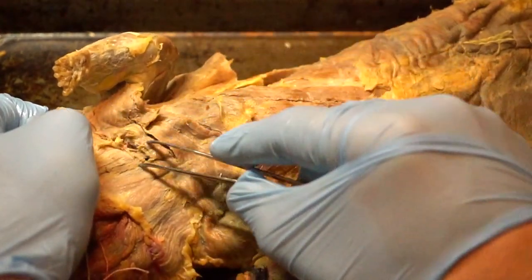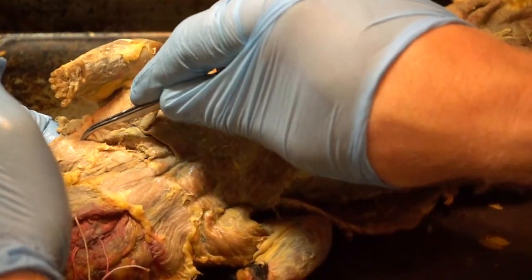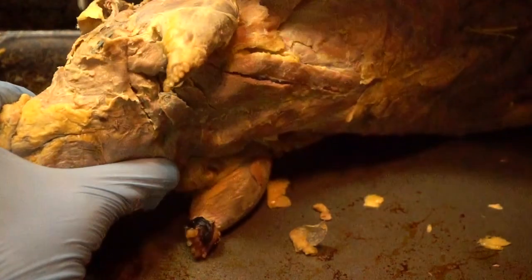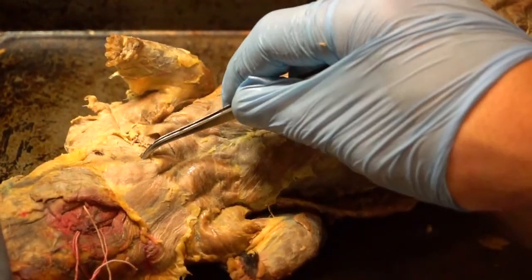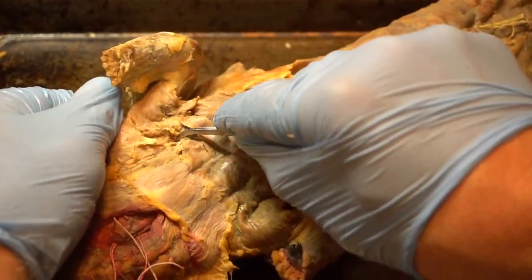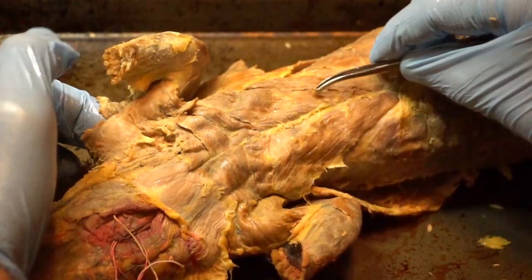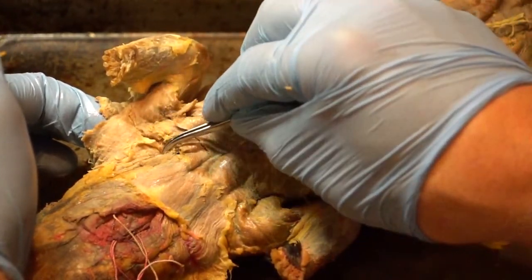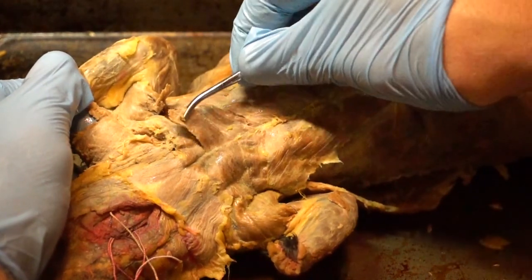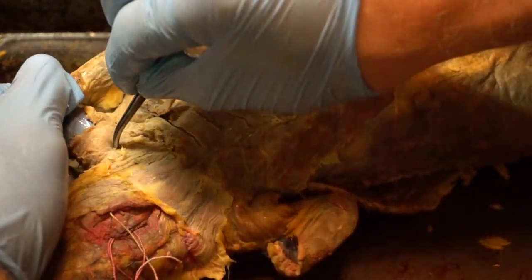When we cut out the rest of the pectoralis major at the upper anterior border, we cut it away from a muscle we covered last class — the clavotrapezius and clavideltoid. If you get the border out you'll also see another muscle underneath, which is still your pectoralis minor extending all the way up on the mink and cat. The pectoralis major is actually on top of the pectoralis minor. So one more time: xiphyhumeralis, pectoralis minor, pectoralis major, pecto antebrachialis, pectoralis major, pectoralis minor deep, and clavotrapezius/clavideltoid.